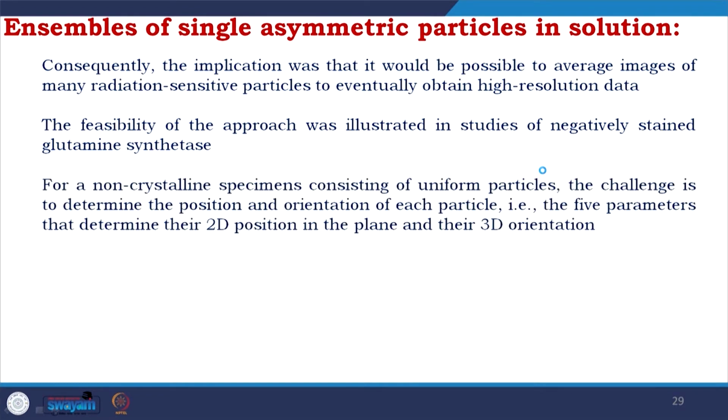For a non-crystalline specimen consisting of uniform particles, the challenge is to determine the position and orientation of each particle, that is the 5 parameters that determine their 2D position in the plane and their 3D orientation. So, 2D position x and y and 3D orientation.